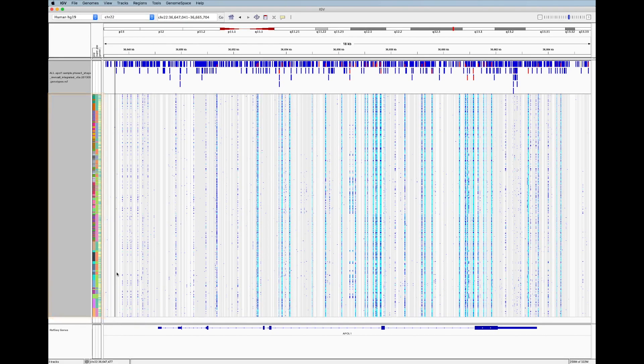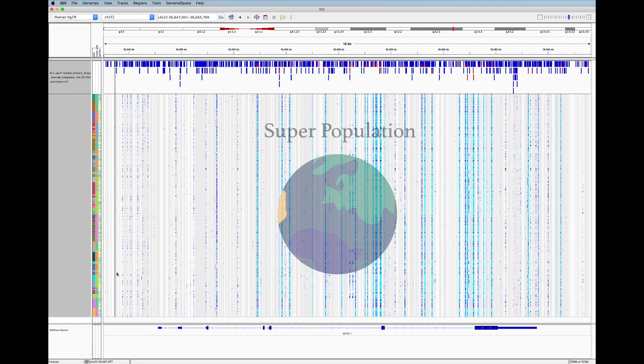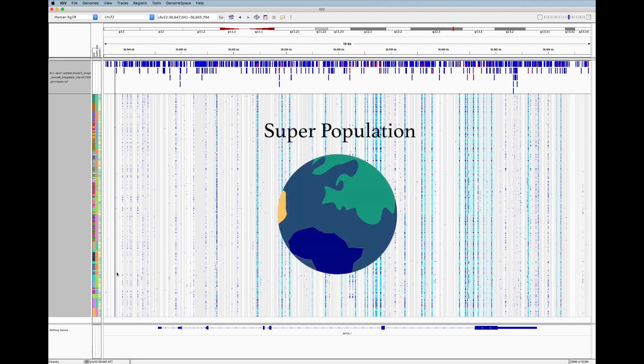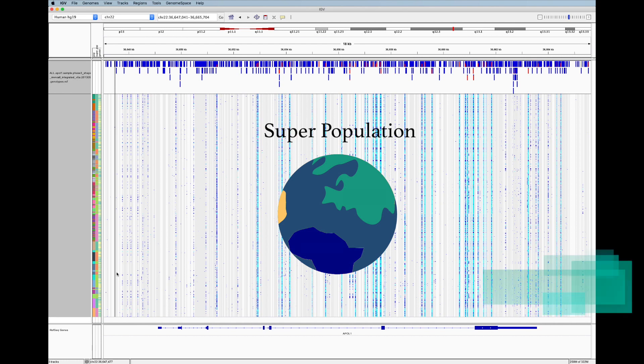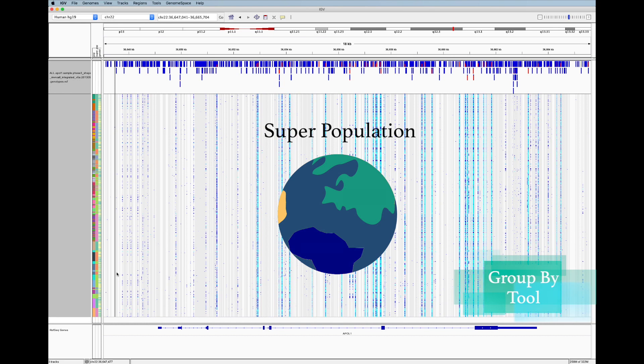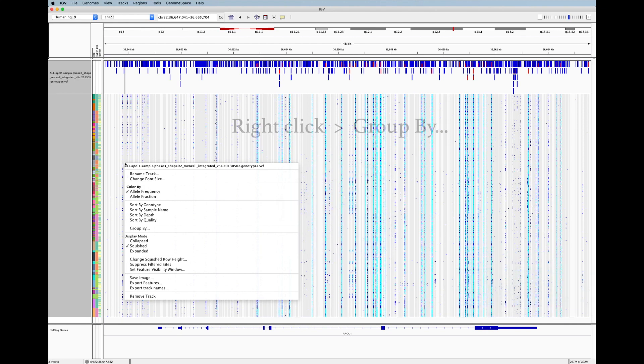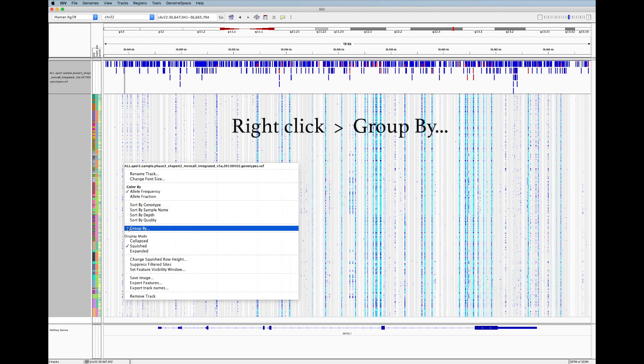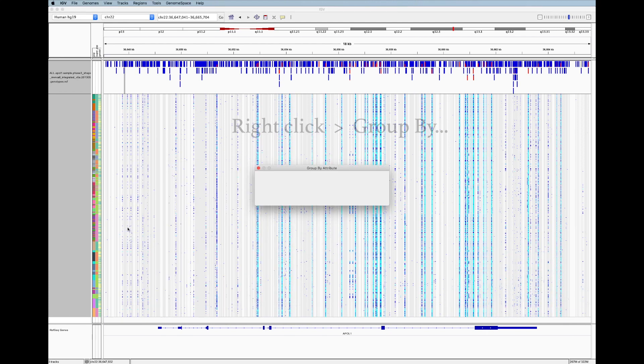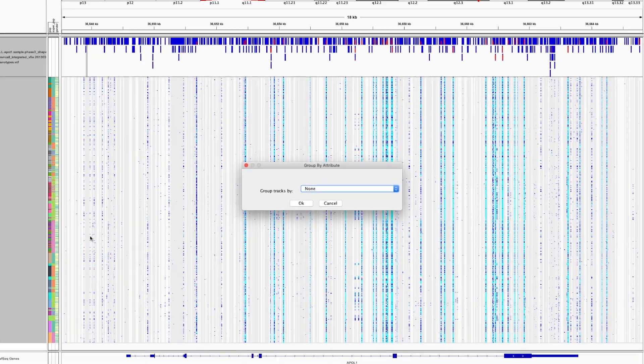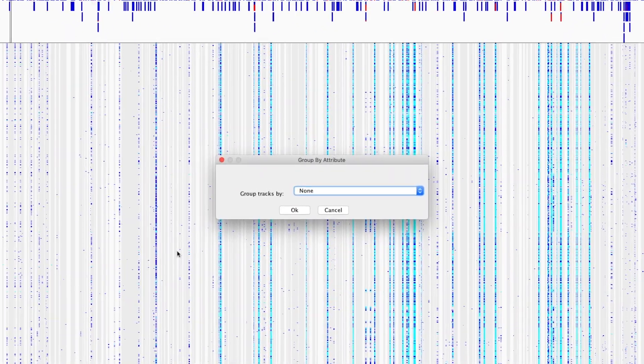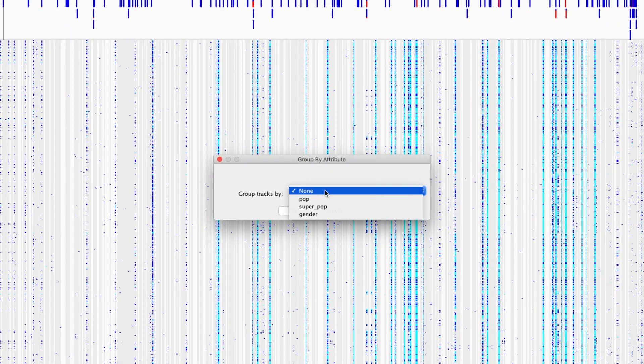Let's first look for variant patterns based on superpopulation. To find these patterns, we need to be able to group the samples in the same superpopulation together. To do this, we use the appropriately named group by tool by right clicking, group by, and selecting the annotation to group the samples by. Let's select superpopulation.